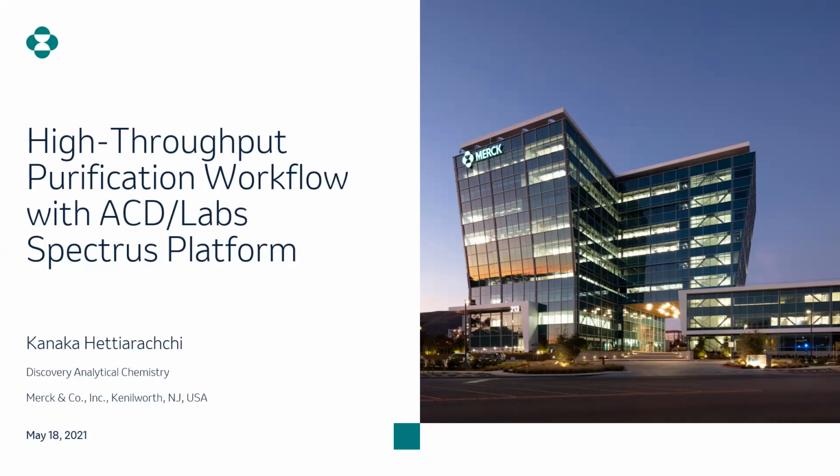My name is Kanaka Hetirachi, and I'm going to be discussing the high-throughput purification workflow with the ACDLabs Spectrus platform that we recently implemented at our South San Francisco facility. Today, I intend to present how we're using this software to really enhance our high throughput purification lab operations and also to improve data integrity.